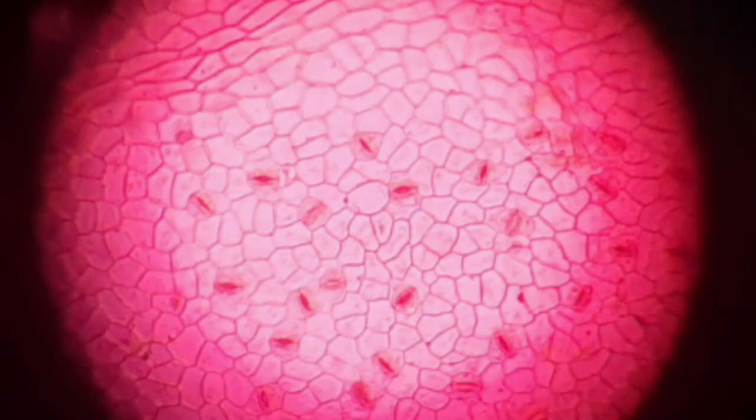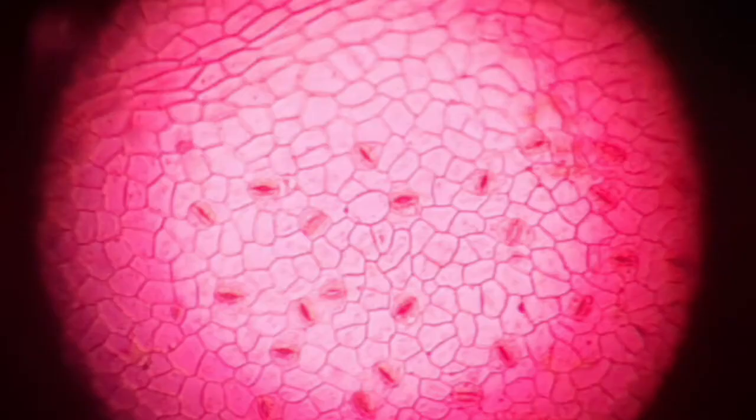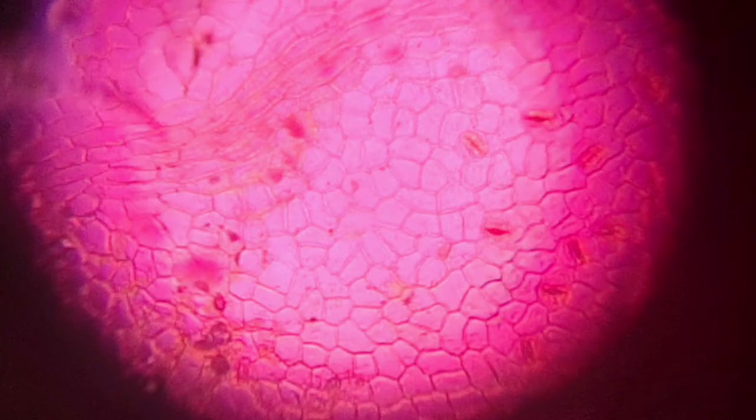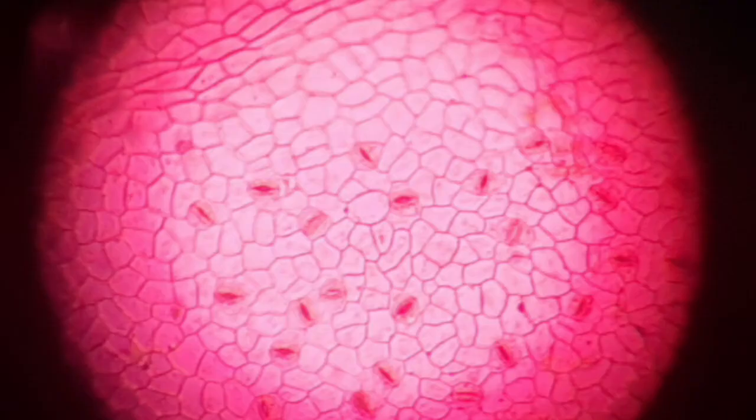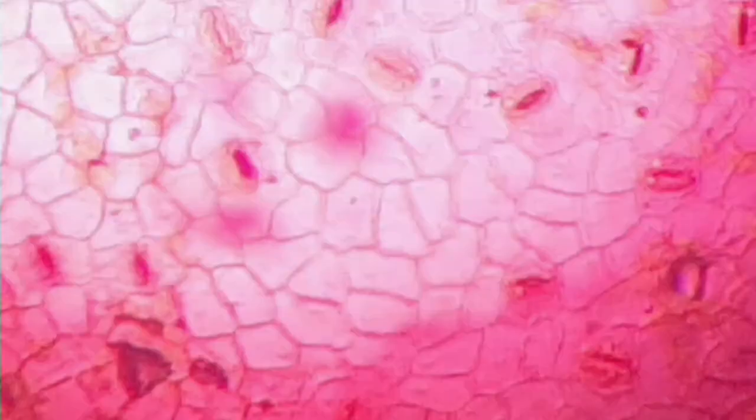So what do you observe under the microscope? It depends upon when you are plucking out the leaves and the conditions of the environment. So here you can see the stomata are closed because I have taken these leaves in the morning, around 10 o'clock, but it was too hot today, so the stomata were closed by that time due to transpiration.